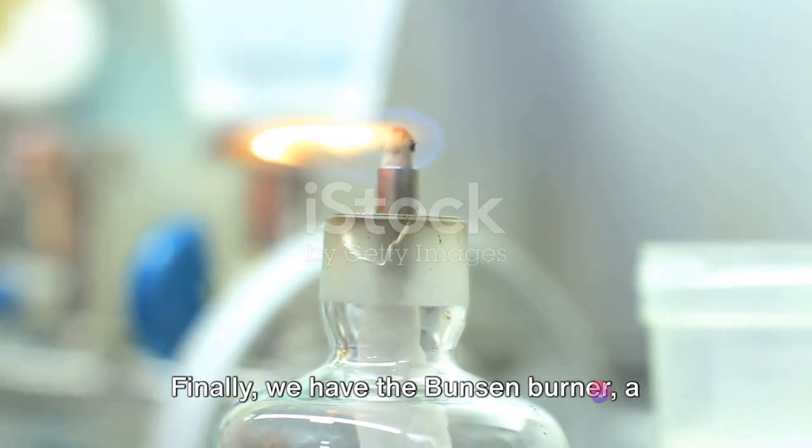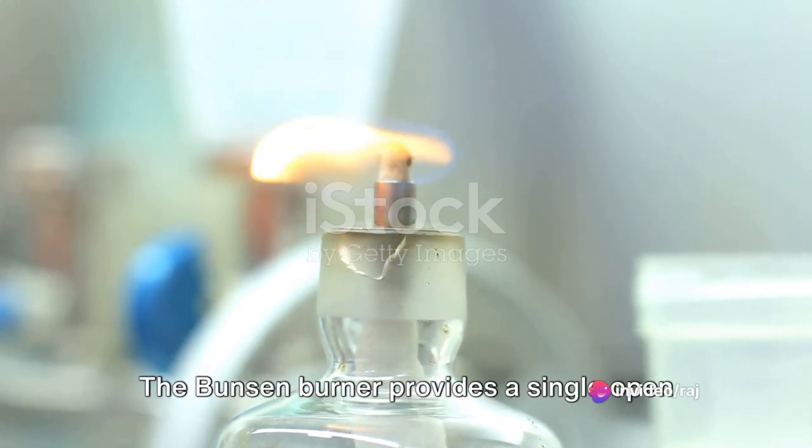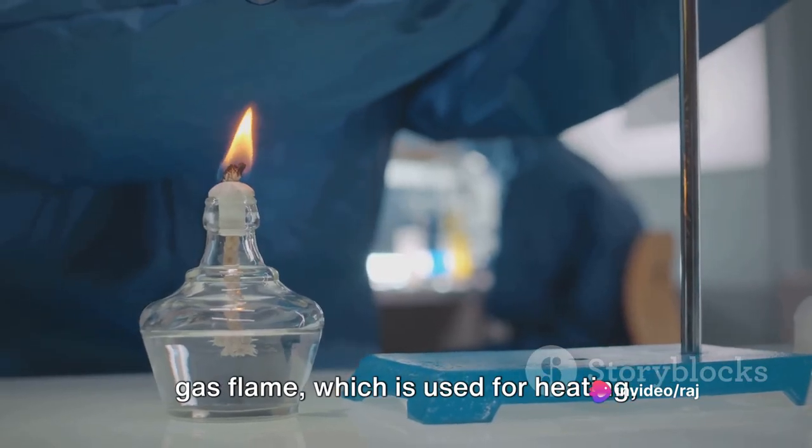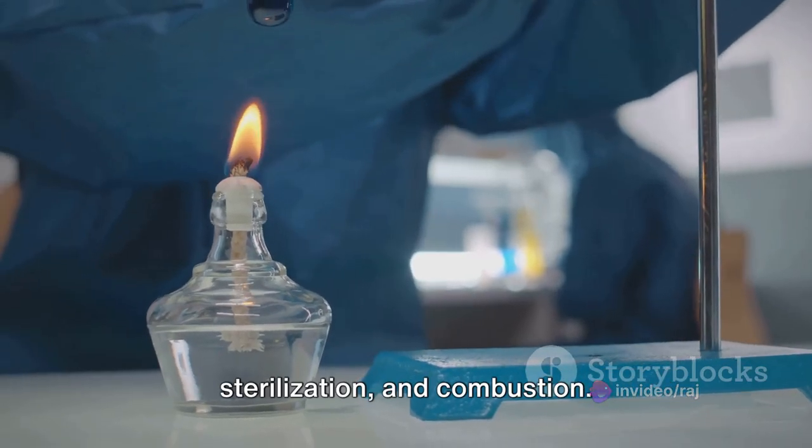Finally, we have the Bunsen burner, a staple in any chemistry lab. The Bunsen burner provides a single open gas flame, which is used for heating, sterilization, and combustion.